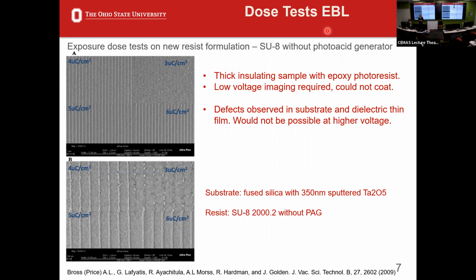This project was really important, and we needed to know the morphology of the surface, because it was for an optical grating for a low temperature atomic physics project. They were trying to make grating couplers, and the surface roughness and cleanliness was really important. So we had to be able to image it and know what we were doing as we processed. We did that with AFM, which gives you some idea of what's going on, but we actually used this as a test bed for this microscope.